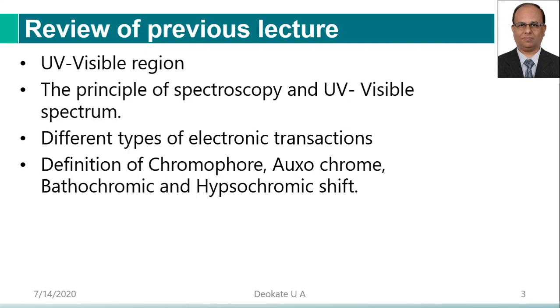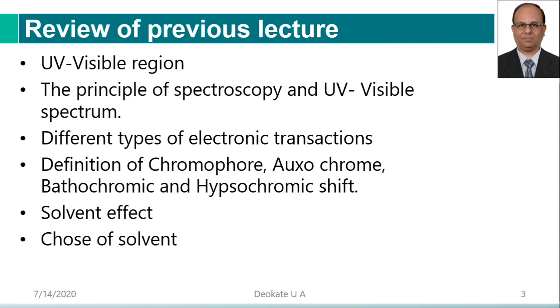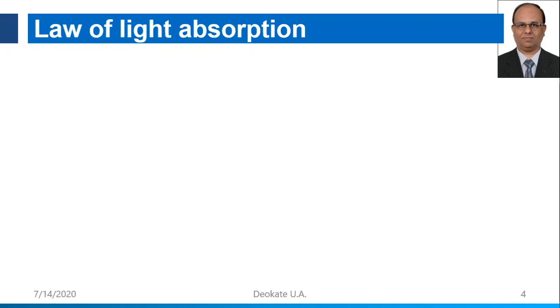Bathochromic shift, also known as the red shift, is the shift of the lambda max toward the higher side. Hypsochromic shift is the shift of the lambda max towards the lower side, that is the blue side, therefore also known as the blue shift. Then we have studied the effect of solvent, what sort of solvents we should use, that is the choice of solvent, which depends upon the absorption of the solvent in the range. So we have studied the cutoff wavelengths of various solvents which are to be selected for ultraviolet-visible spectroscopy.